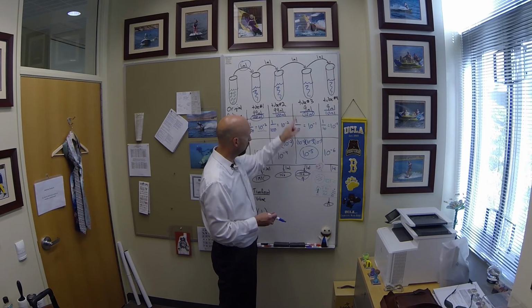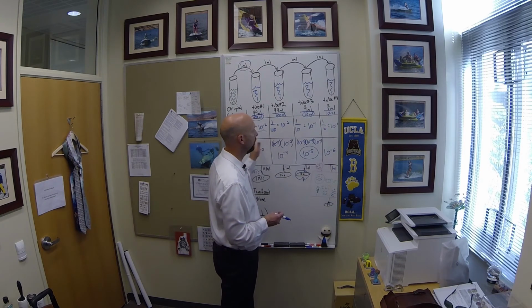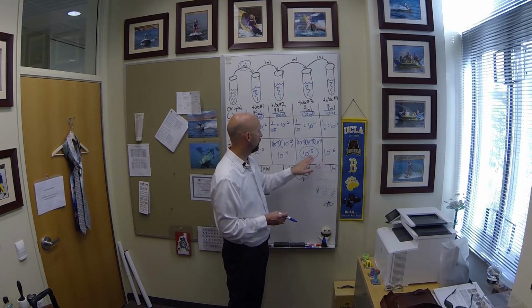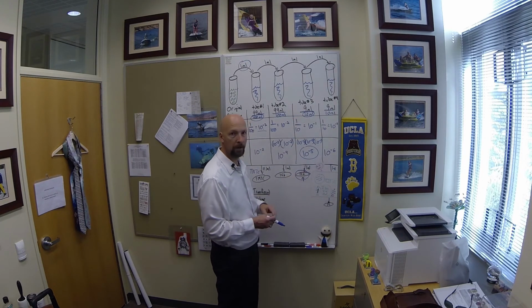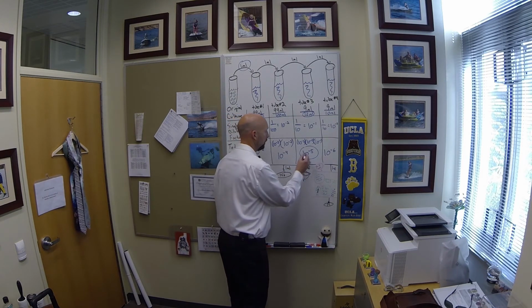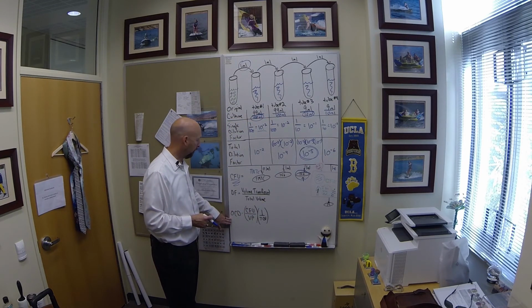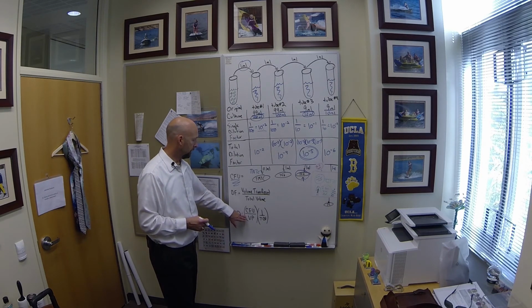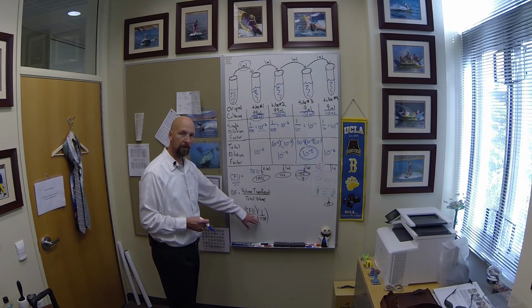Now that we've determined which tube we're going to use because of the colony count, we can ignore the other tubes, and we don't need the total dilution factors in these other tubes. So the total dilution factor in tube number 3, because we got 132 colonies after we plated 1 mil, is 10 to the minus 5th. Well, you need to know this formula. The original culture density, OCD, is CFU, the colony forming units, over VP, volume plated, times the reciprocal of the total dilution factor. Okay?